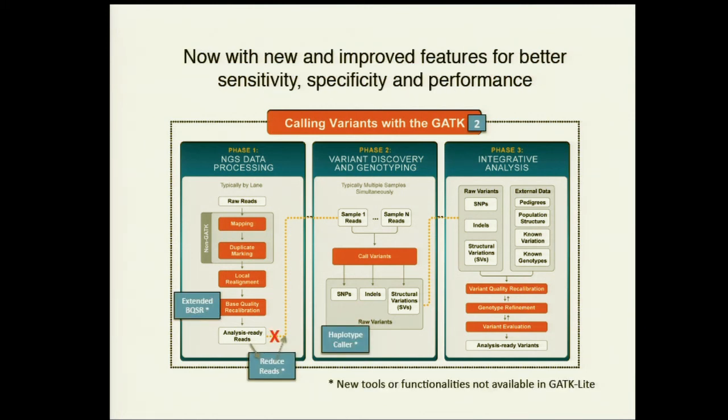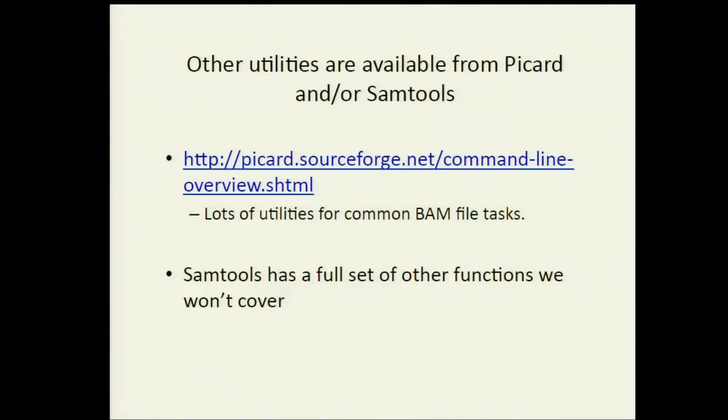I should also point out with the GATK, there's light and full versions. For academic users, it's not really an issue. Everyone gets the full version. But there's new functionality that's been added where we're really trailblazing and leading the pack, in particular better indel and larger variant substitution calling. And also the ability to call really larger sets of samples together, larger batches. I'm not going to give you details here because I think Ami and other people will too.